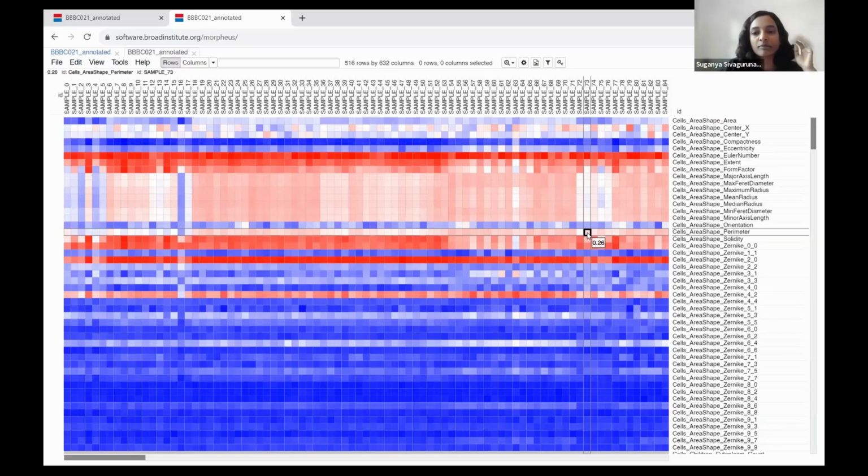This is why we need to do normalization. And even in the exercise, you'll be playing around with the normalized and unnormalized data to see how that impacts the similarity matrices.